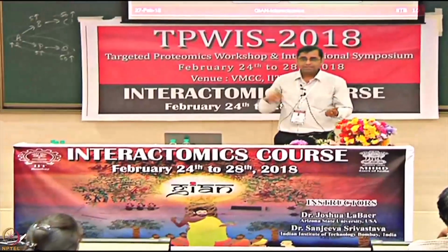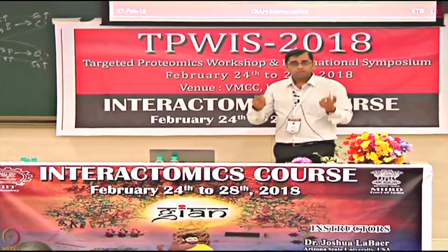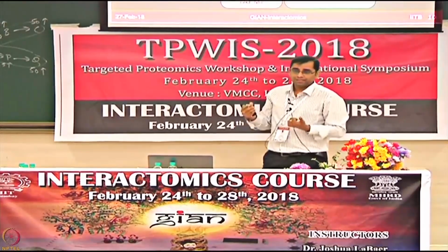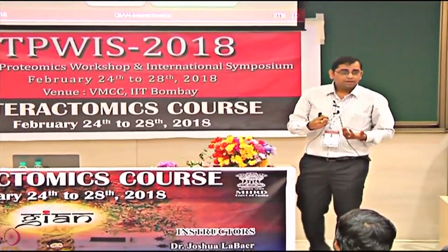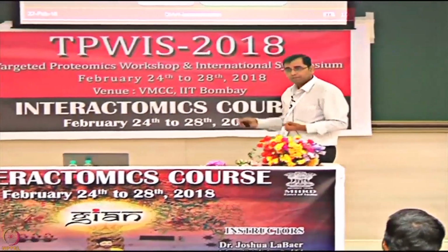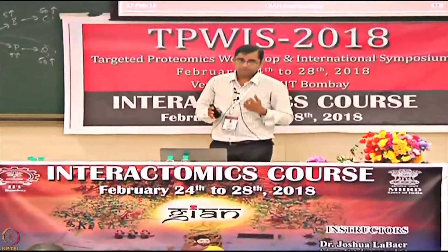They will take BSA, anti-BSA, or if you tell them there are 5 more interesting proteins to test out, they will take those highly abundant proteins and robust antibodies to test those assays. And these things are usually not good, because when you want to try your actual experiment, which many times depends on low abundant proteins and antibodies that are not so great, your assays don't work as robustly as you would have seen at the proof of concept level.